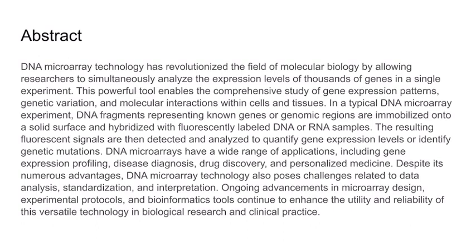DNA microarrays have a wide range of applications, including gene expression profiling, disease diagnosis, drug discovery, and personalized medicine. Despite its numerous advantages, DNA microarray technology also poses challenges related to data analysis, standardization, and interpretation. Ongoing advancements in microarray design, experimental protocols, and bioinformatics tools continue to enhance the utility and reliability of this versatile technology in biological research and clinical practice.